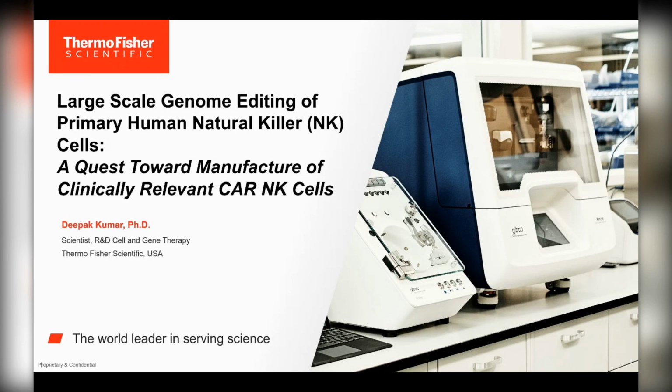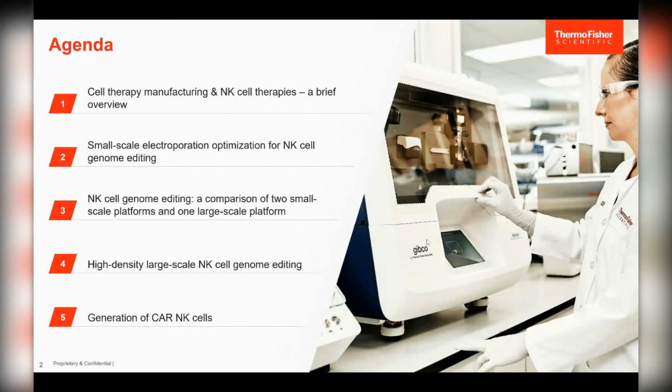Hello, everyone. Thank you for joining the webinar today. Today I will be discussing large-scale genome editing of primary human NK cells.